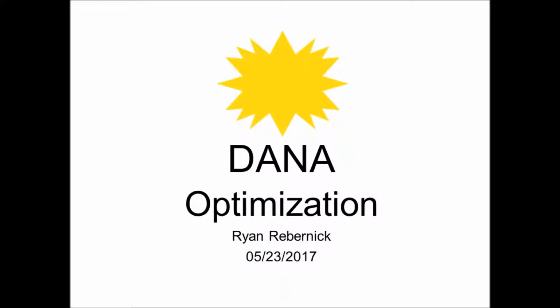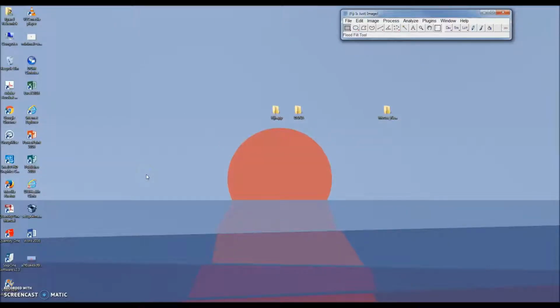In this video, we're going to talk about how to optimize DANA, DNA area NETosis analysis, and this is going to allow you to use it for different cell types, different species, and different stains. I'm going to show you how DANA was optimized to DAPI stained mouse neutrophil images.